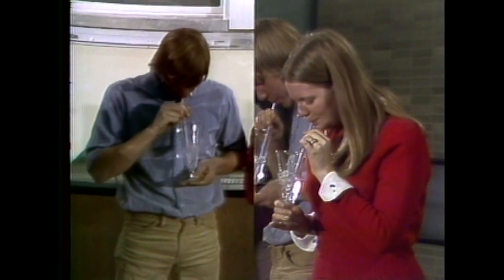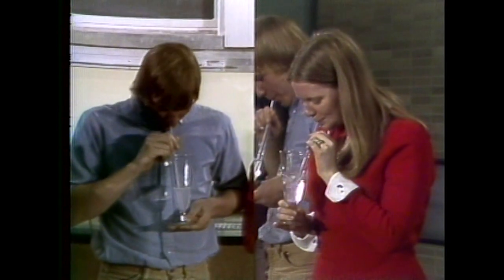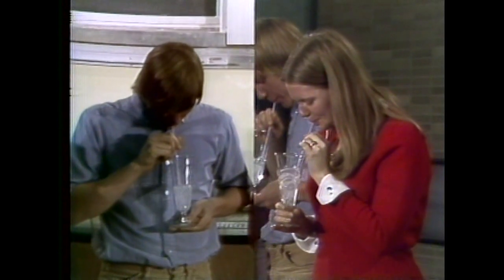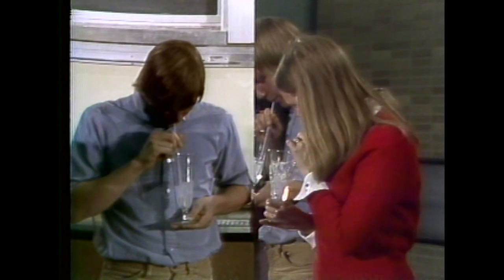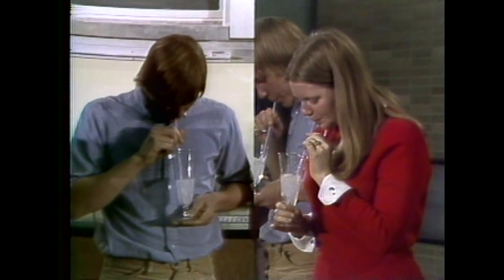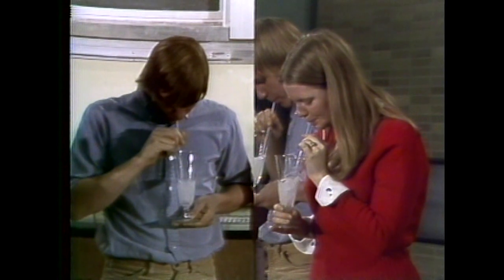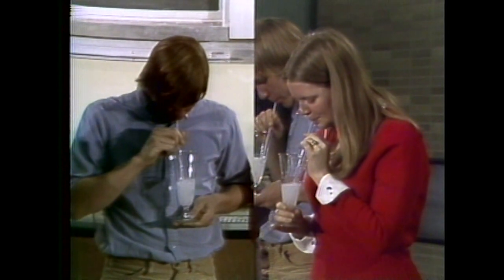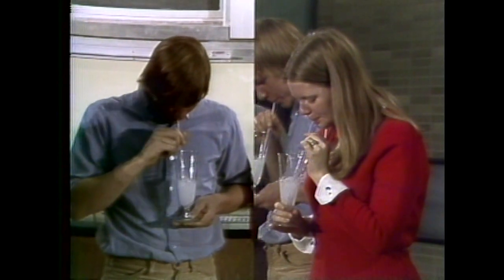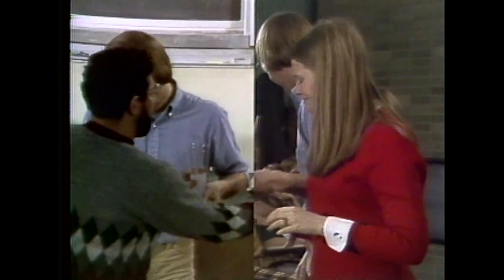And you see that in one of the containers here, we are developing a rather cloudy situation. And what's happening is that the calcium hydroxide is absorbing the carbon dioxide that they are exhaling, and they're forming calcium carbonate. And I think it's pretty close to a draw, so why don't you just stop now. Thank you both very much.